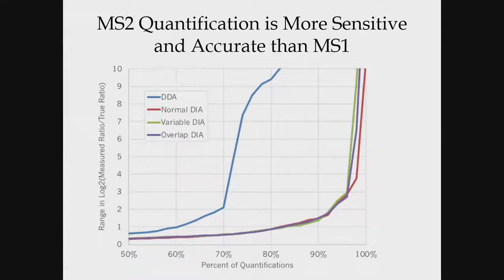Yeah. So just to orient myself, I've seen this plot a few times, but as soon as it crosses the one line, that's a twofold change, right? That is correct, yeah. And those are peptides or those are proteins? These are peptides. They're all phosphopeptides. There are 660 phosphopeptides.